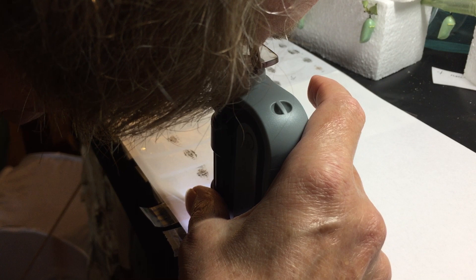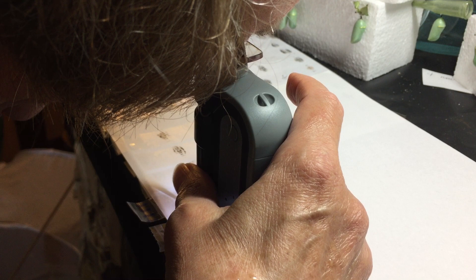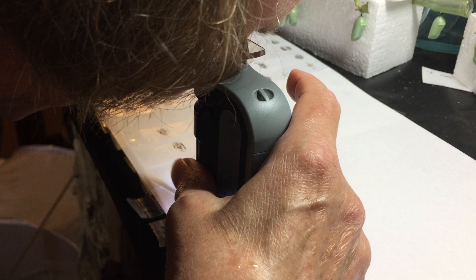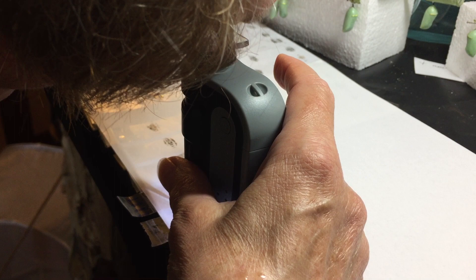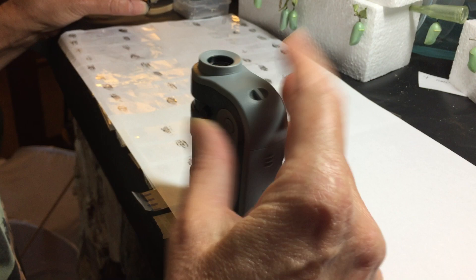Another one gets to be released. There might be three little spores right there, but I release if it is that minimal. Now if I see three little pockets that would be another story, but three single little football-shaped spores is okay. I will post in the comments some individual photos of what the scales look like.